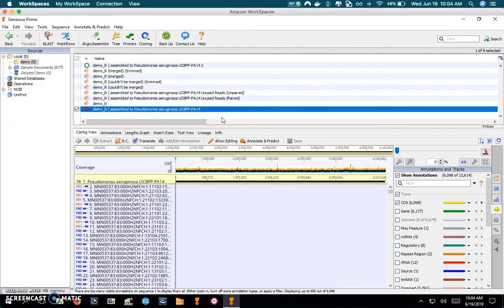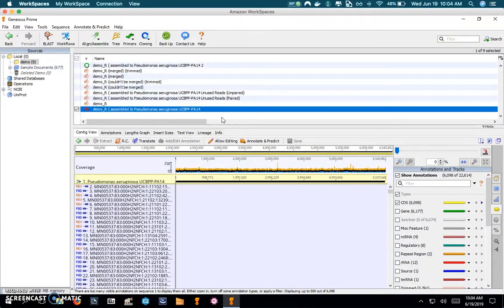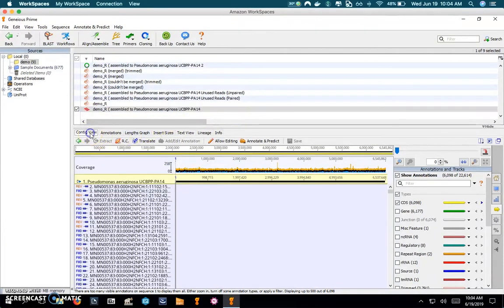This is what it brings up and what we want to do here is try to configure this correctly so we have it all set up to look at coverage. So the first thing we'll do is click on contig view.